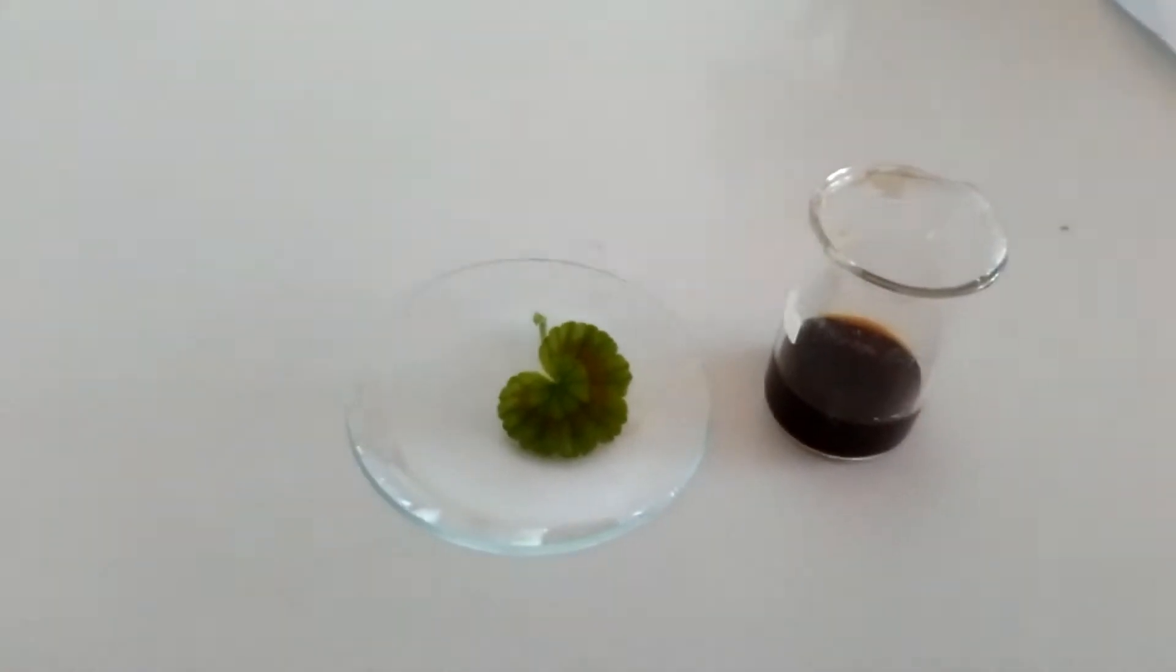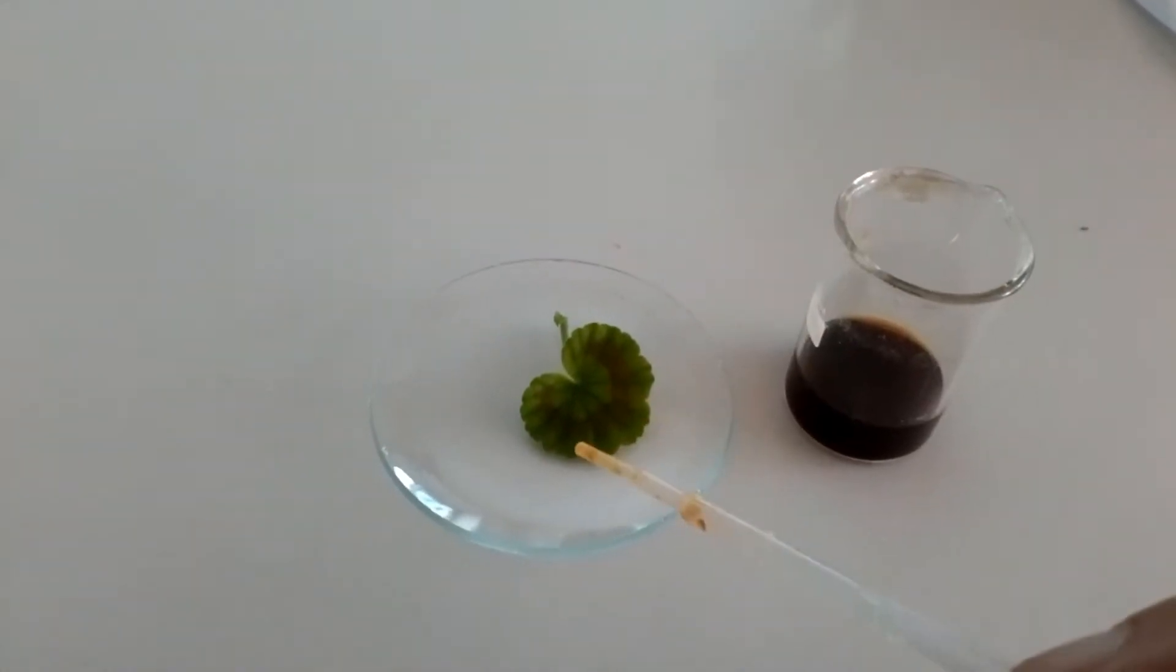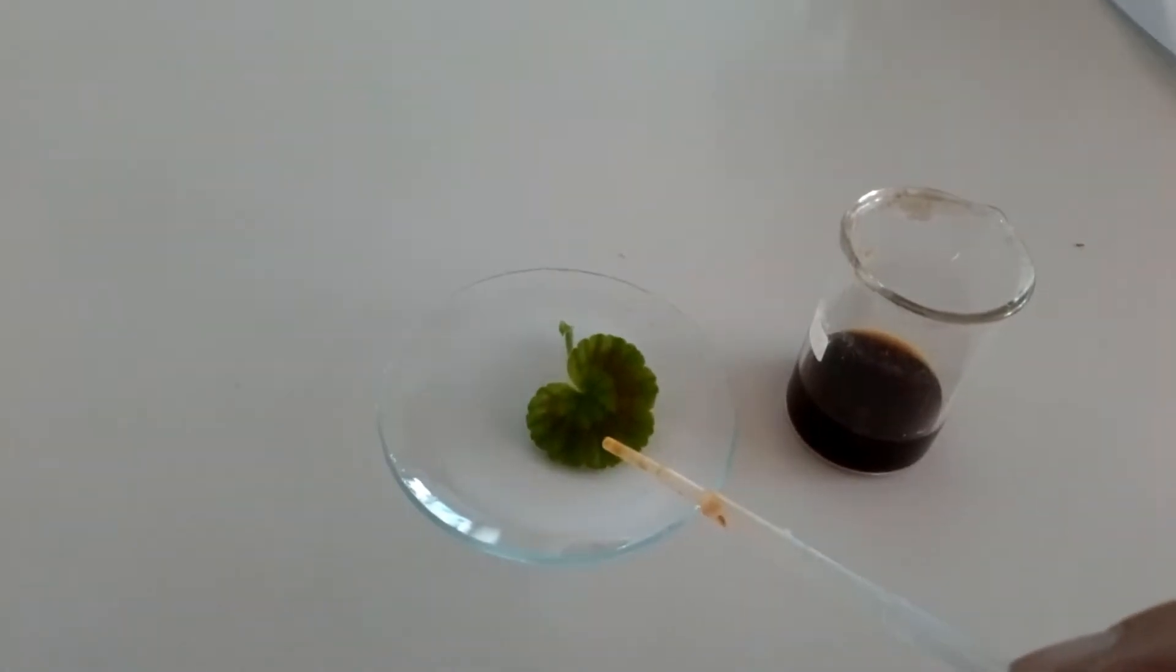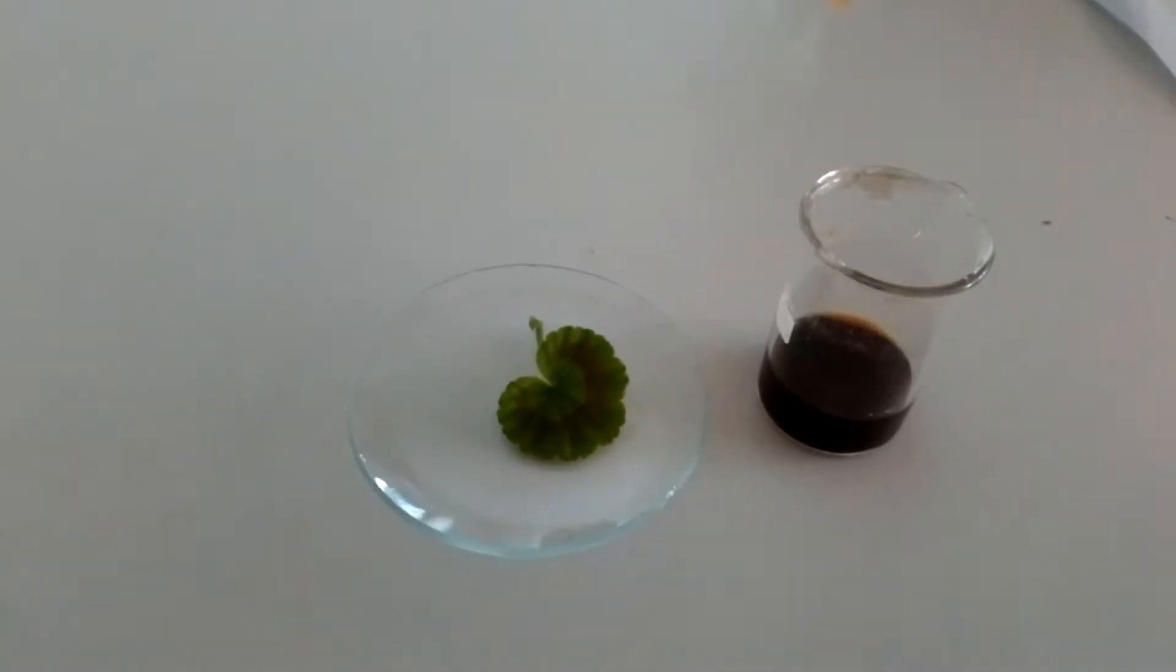Now the first thing we've got to realize here is that the starch, any starch inside the leaf here, is all locked up inside the cells. We know that the cells have got a cell wall around them made of cellulose.